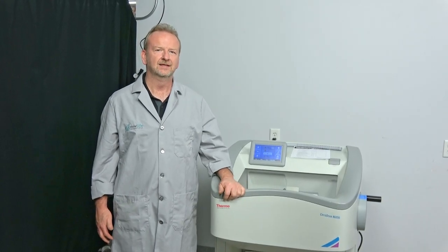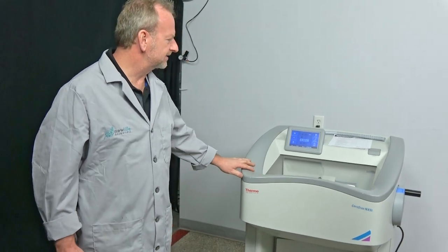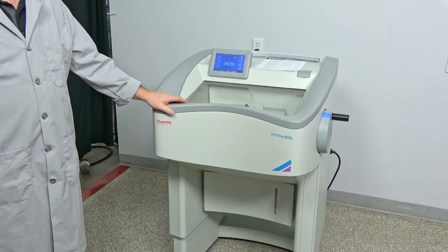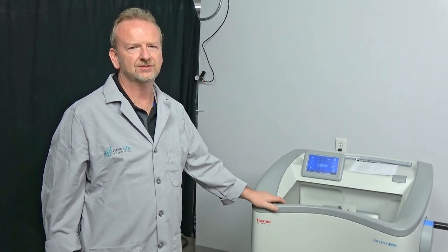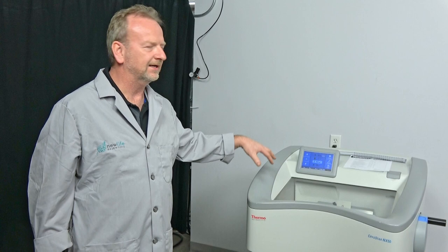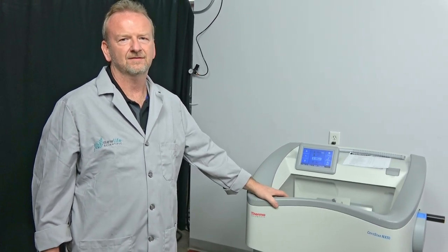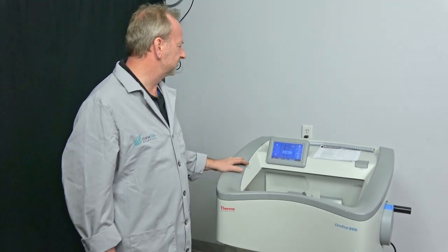Hi, I'm Richard from New Life Scientific. Today I wanted to show off this very nice Cryostar NX50. When I get a really nice one in, I always want to shoot a video of it, because going through this one I really didn't see a whole lot of signs of usage on it. Usually on the inside you get marks where they've been compressing specimens and stuff, but I didn't see any of that. We're just going to go over some of the things we did and some of the options on it.